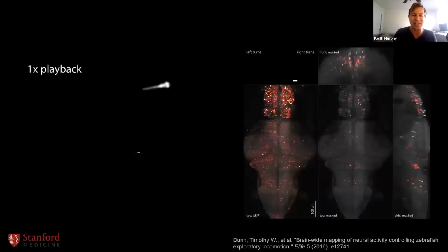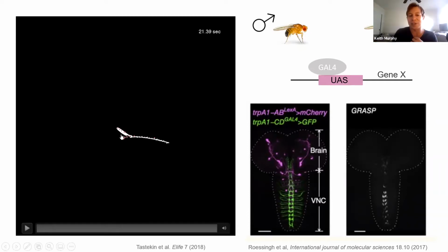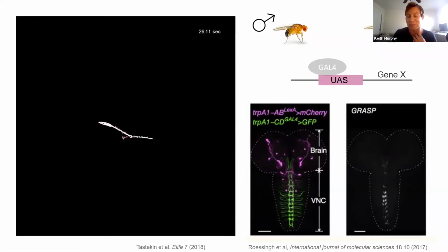Great model organism. Well, the worm is just easy to couple ultrasound to because they're in a water bath or something. But with the fly, it's in air. So coupling maybe is an issue. Oh, so I should say that when a Drosophila is a larva, so this is actually a larva over here, you can put them in a fluid solution or you can put them on top of an agar plate. So you're actually getting direct coupling. And there are probably more labs using fruit flies than there are C. elegans. So that's why I kind of want people to get into it. But like you said, it hasn't picked up yet.